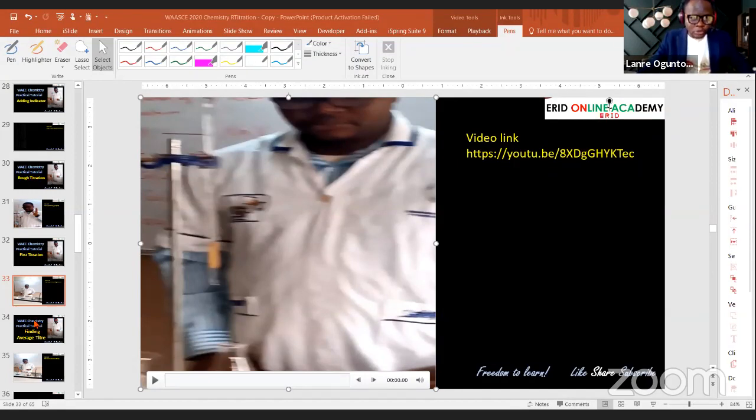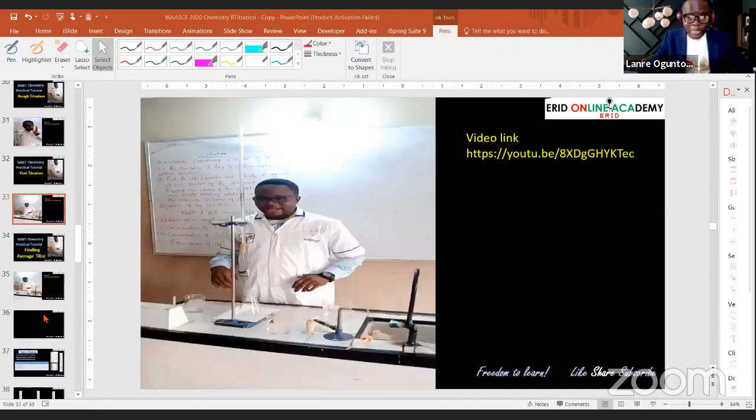So we'll look at how to find the average value. Then we'll go straight into the main thing, which is calculation, and of course that is where the bulk of your work will be. Quickly, based on what you have seen so far in doing your rough and your first titration, I want you to tell me something you have learned on this, or if you have an addition that you want to state.